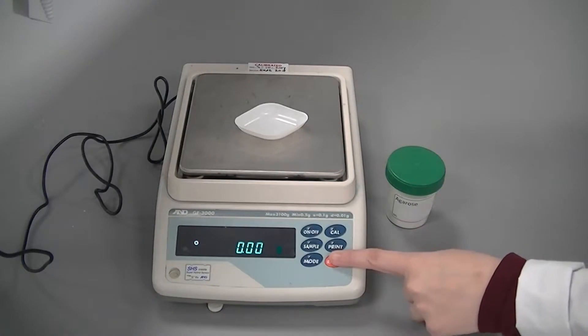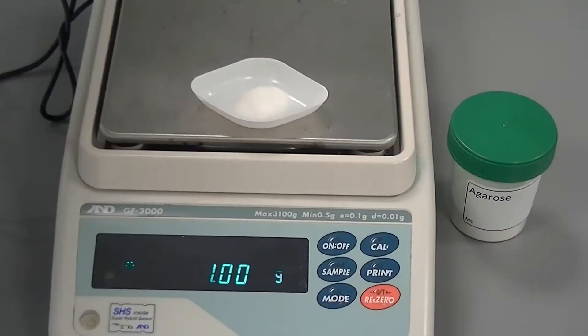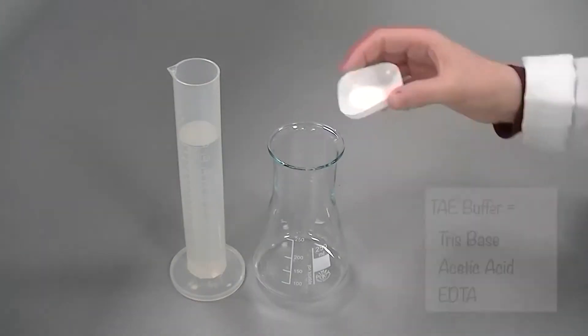Make sure you zero the scales before you start weighing. Measure out the required amount of agarose powder and volume of TAE buffer and add to the conical flask.